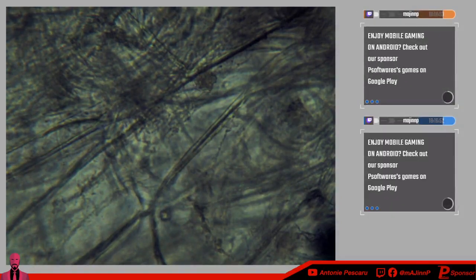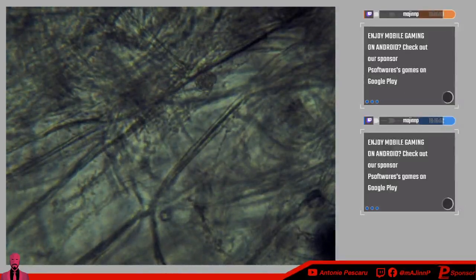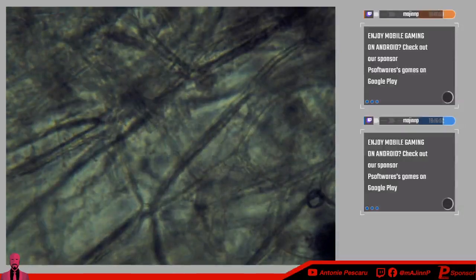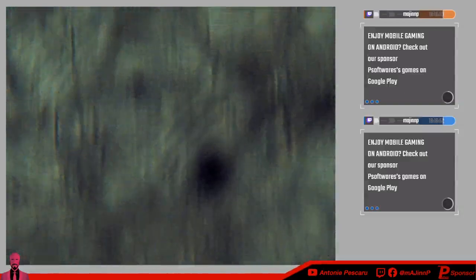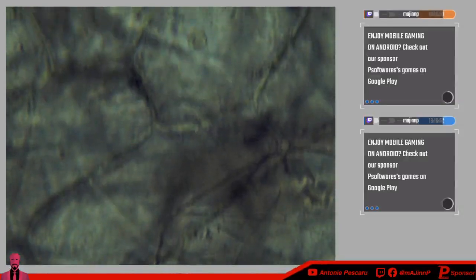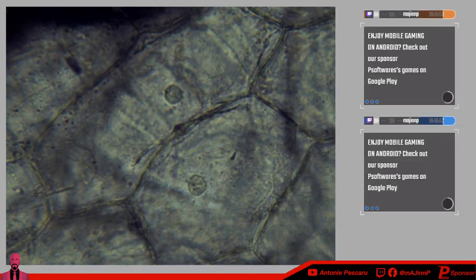With that being said, I'll try to see if I can focus in. No, I think that's the max that I can focus. Let me see if I can find, because like I said, they're all bunched up together and it's not very good. Ooh, perfect. Oh my goodness, these are perfect ones. There's two perfect ones that I just found. No way. Nice one. All right, so as you can see, I'm drawing the shape right now with my mouse.